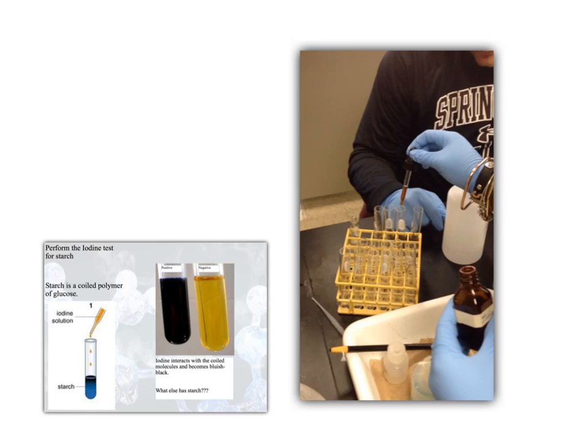And again, for the test, you want a positive control and you want a negative control. So you want to use a sample that you know is going to turn positive, and then you're going to use a sample that you know is going to turn negative, so that when you compare it to your unknown, you know whether or not it's positive or negative.